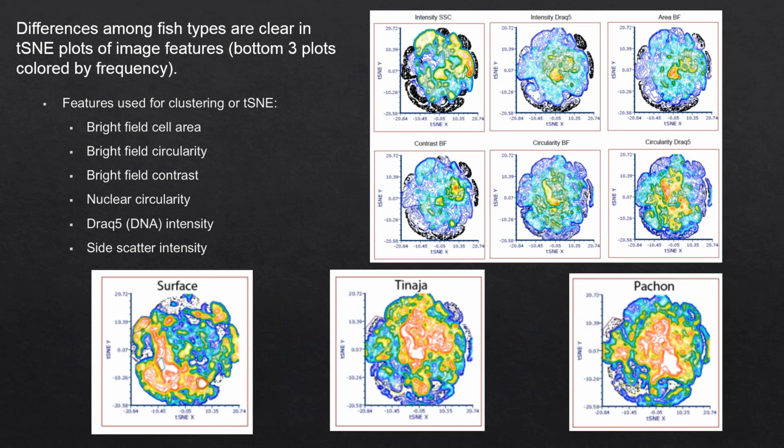So it's useful and informative to lay things out this way, and then run tSNE maybe on several combinations of features that you think will have information content. And it's a nice way to do this iteratively, start by including a bunch. If you see that the plots colored by feature value don't really contain much information, they're just all blue across the field, sometimes it performs better just to take those out because essentially you're just adding noise.